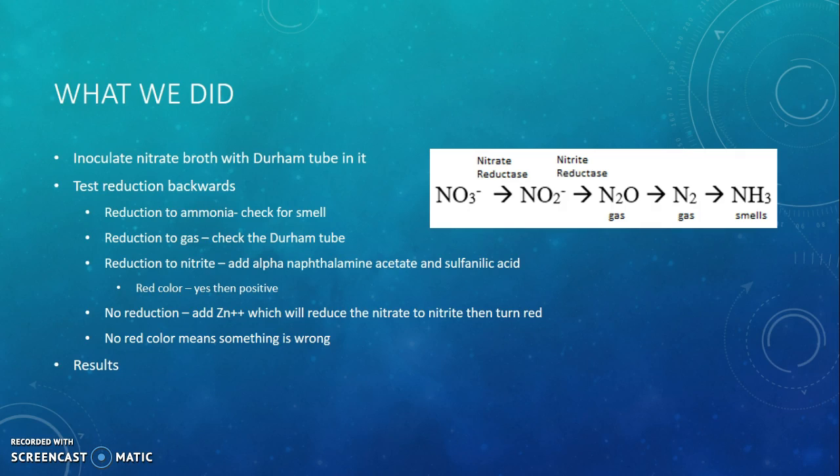Don't panic. It won't smell like ammonia. Like, they're not going to do that to you, right? But it's something that you would test for. It's going to be negative, but you just want to do it for kicks and giggles, all right?